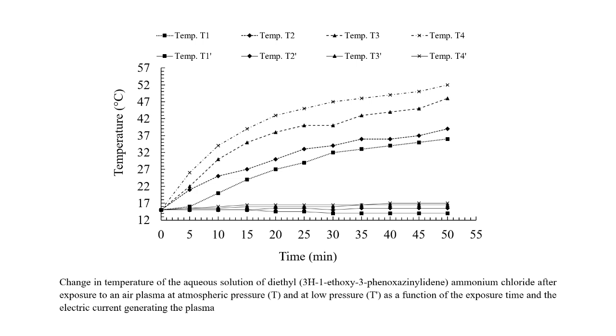This temperature decrease opposes the temperature increase generated by the plasma's energy supplied to the solution. The plasma at atmospheric pressure for the 4 treatments, T1, 2, 3, and 4, generates a temperature increase in the study solution. The behavior of the solution's temperature change is explainable considering the physical processes that occur in the solution when exposed to plasma at atmospheric pressure.